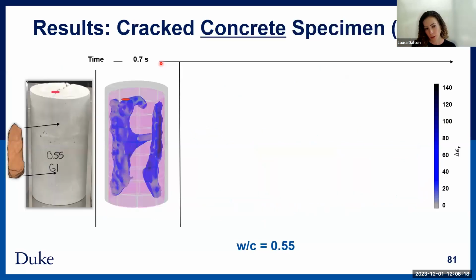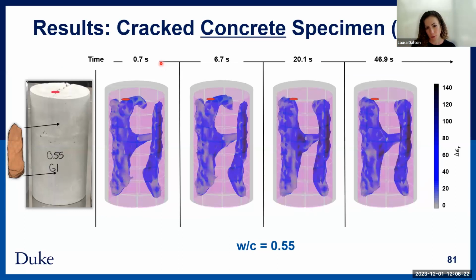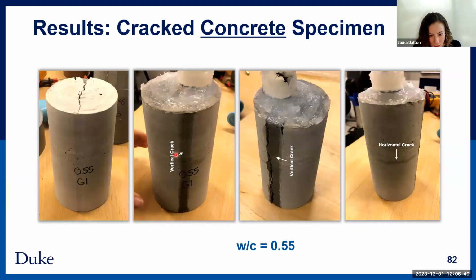And then as for the different crack patterns, this was another sample where, again, there was no water in the center, but also this was as fast as 0.7 seconds. So very, very quickly, the water moved through the sample because it was quite a big crack. And then we're even able to detect this very small horizontal crack.